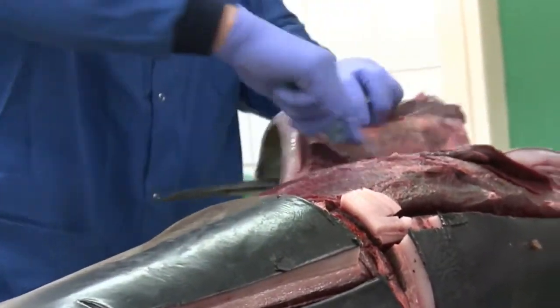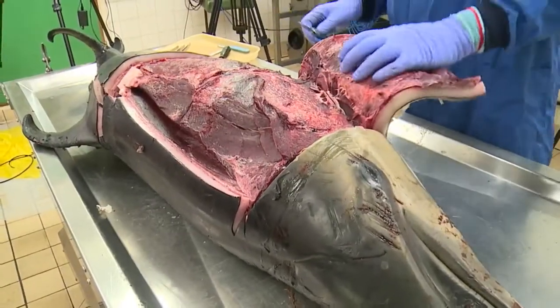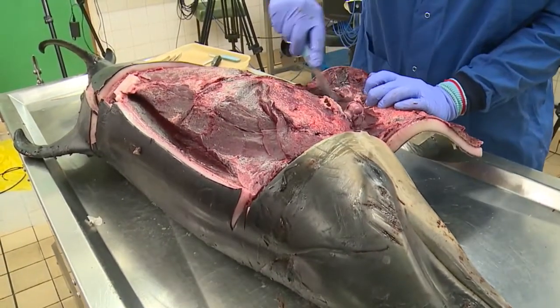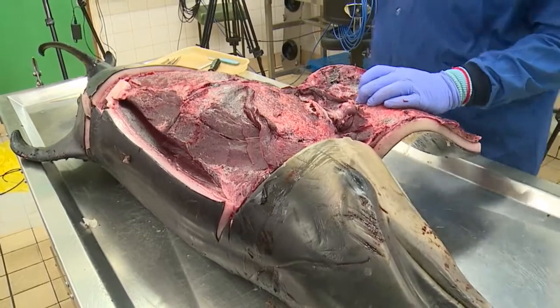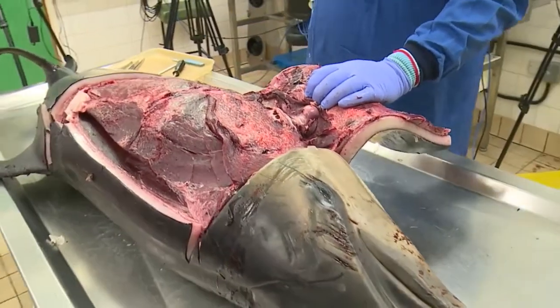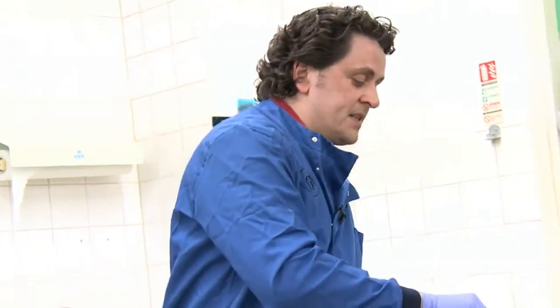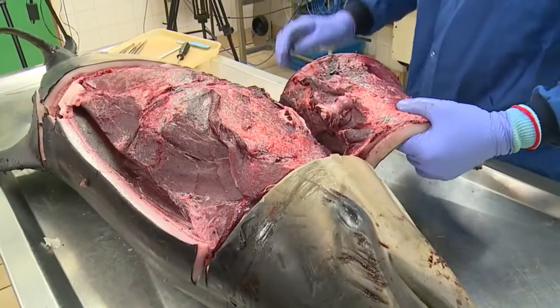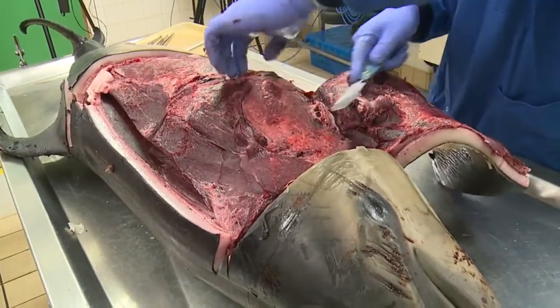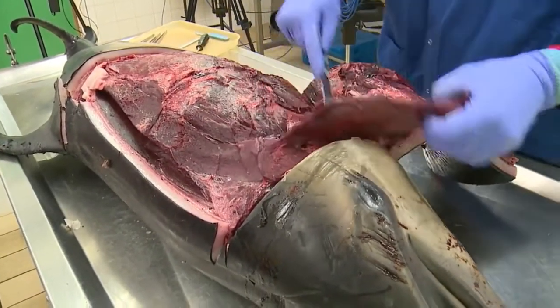As I'm peeling this away, hopefully it's obvious on camera that the meat, the muscle, is actually pretty dark. Actually, before we do that, let's show you the pectoral joint. So, just cutting through that now. If people at home do this, rotate and roll your arm, that's called a ball and socket joint, which enables that arm to rotate freely. Cetaceans have exactly the same kind of joint. So this is the scapula, or the shoulder blade, again, just like us.